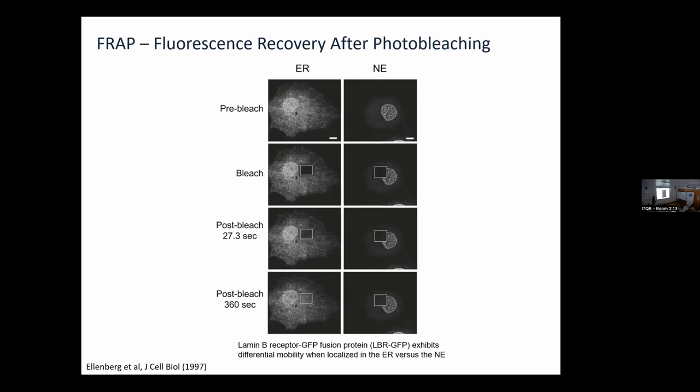The early studies of FRAP show that, with the exception of proteins that are part of the nuclear lamina or histones in the DNA, almost every protein is mobile in the nucleus. They are all moving around. All the organelles that people were seeing with fluorescence in situ hybridization, with immunofluorescence, you know, we have Golgi, we have microtubules, we have the endosomes, and all of these are dynamic.